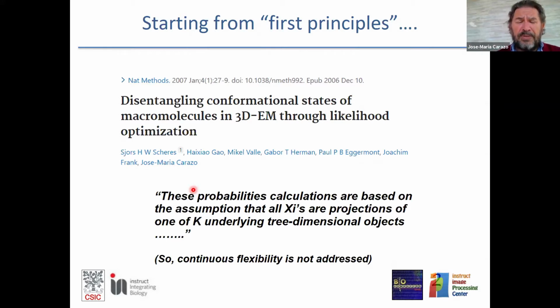And at this moment, we have this principal component analysis, the maximum likelihood principal component analysis that was first developed by him and Tagare and has been refined specifically for this project. A version of it is also in CryoSPARC, and there are other, perhaps more powerful, ways to approach this continuous flexibility.